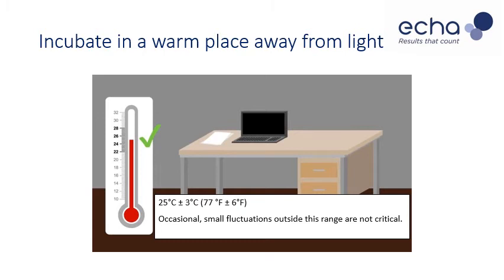the test performance. If testing samples from tanks in warmer climates, then higher ambient temperatures can be used, as these will reflect the growth preference of any microbes present. However, we do not recommend incubating the test above 40 degrees centigrade. That's 104 degrees Fahrenheit.